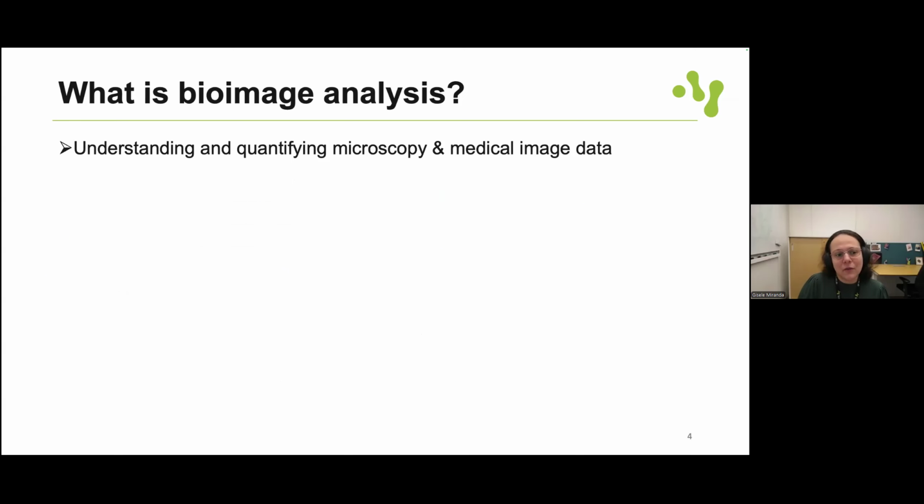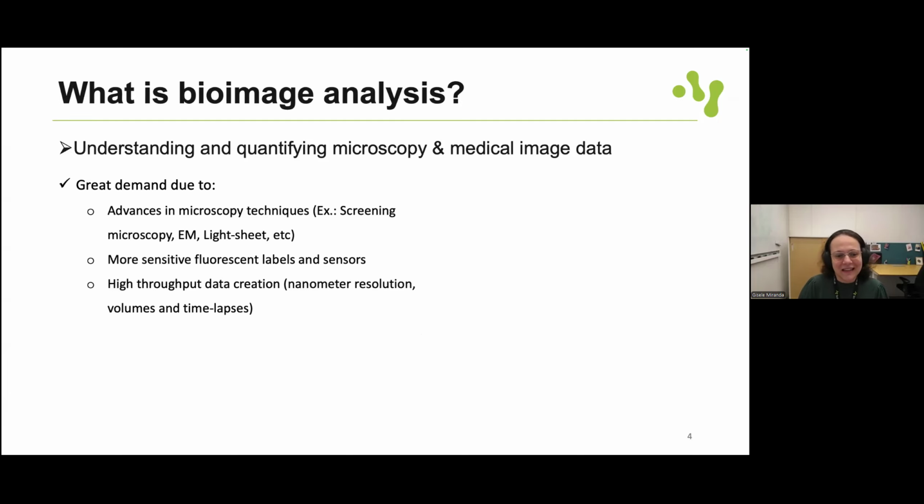So why don't we analyze manually anymore? I think I don't have to motivate it much here, but we have high throughput data creation. We have advanced microscopy techniques. We can think here about light sheet, different optical modalities, EM, screening microscopy. We also have more fluorescent labels and sensors to tag different proteins, for instance.